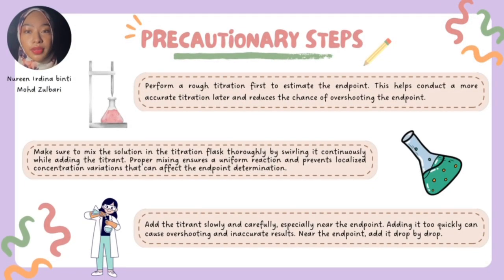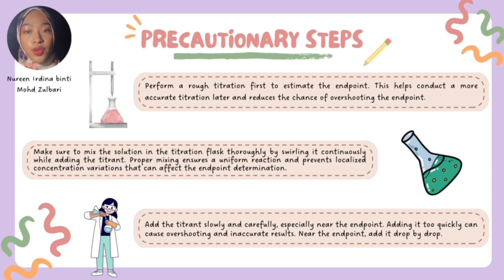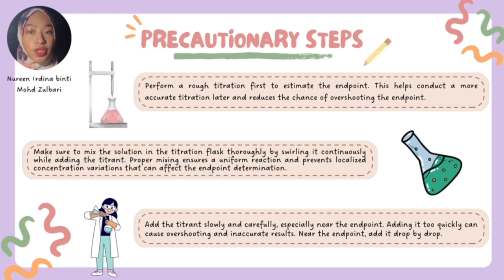Now we are covering some key precautions for successful titration. First, always start with a rough titration to estimate the endpoint — it sets the stage for precision and avoids overshoots. Next, swirl the titration flask continuously. Uniform mixing ensures a smoother reaction, preventing any concentration inconsistencies that could affect your endpoint.